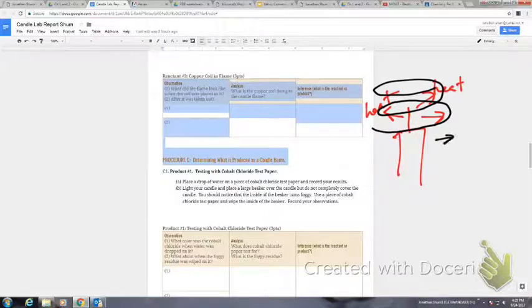And so what it tells you is that if you remove heat and the flame kind of goes out, that means that heat is one of the reactants. You might think of it as the match or sparker or some kind of spark. But really what it is, you're creating heat so that the flame or the heat can interact with the oxygen and the fuel, okay? And if you remove the heat from the candle by absorbing it using the copper coil, the flame gets smaller or weaker.